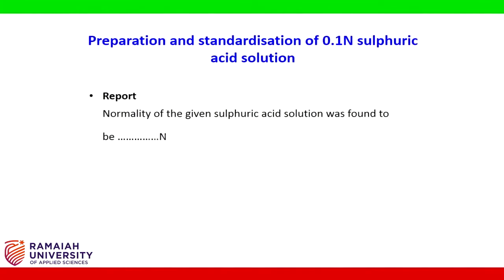Finally, the normality of given sulfuric acid solution is reported.